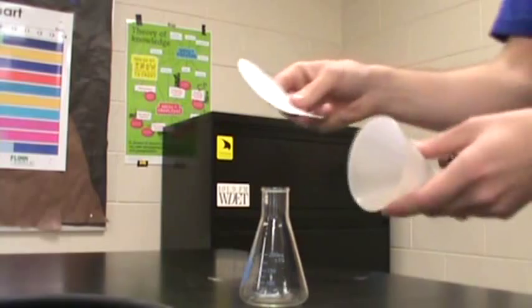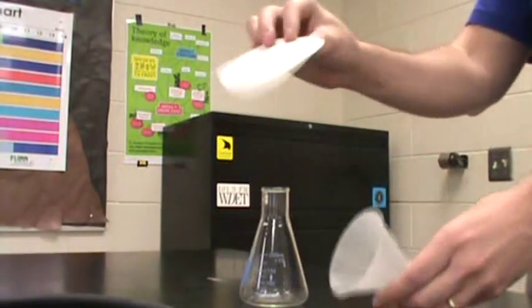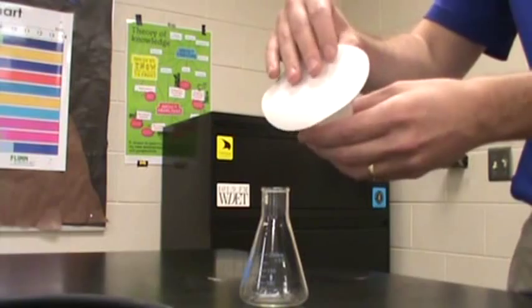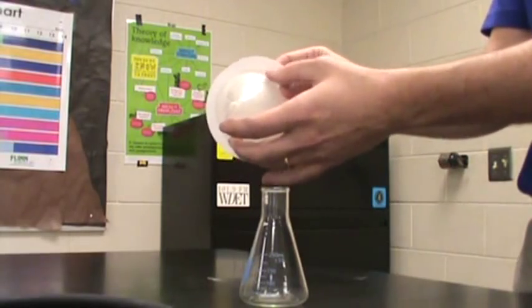So folding filter paper is really easy. A lot of people in chemistry classes will tell you really complicated ways to do it — a lot of you fold and kind of make an origami giraffe and all kinds of things. All you have to do is take your filter paper, set it on top of the cone, and kind of get it pretty even around so that you have the same kind of space on all sides.